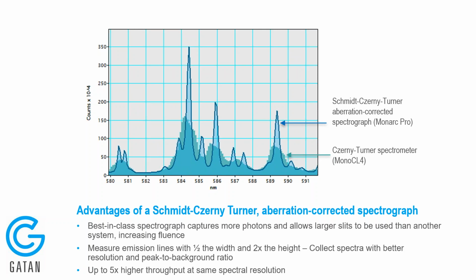When you're collecting just a single spectrum like you are here, that probably doesn't make a great deal of difference because you're just talking about a saving of a few milliseconds or a few seconds, and at most a few tens of seconds.